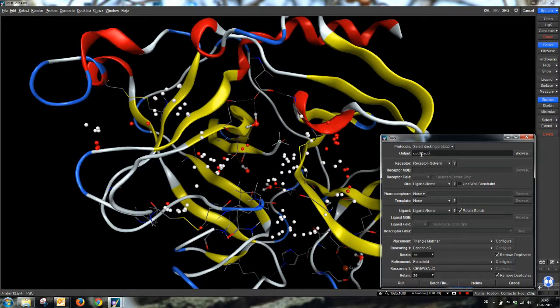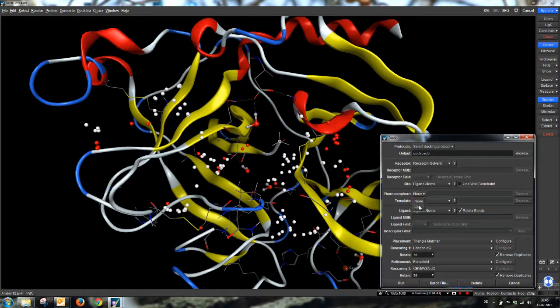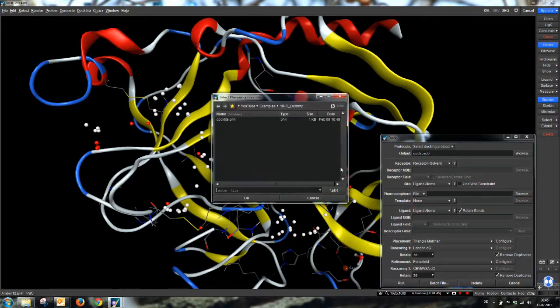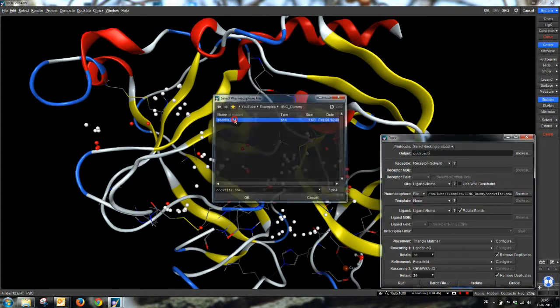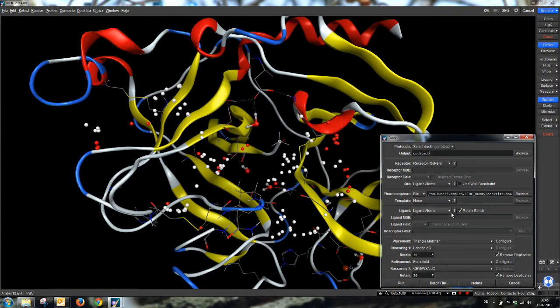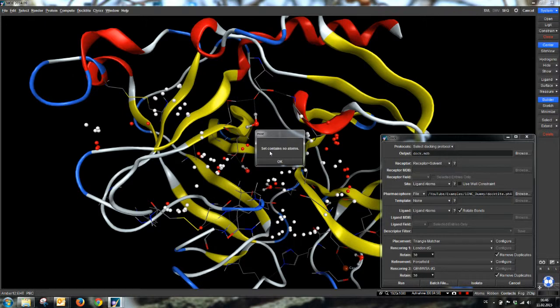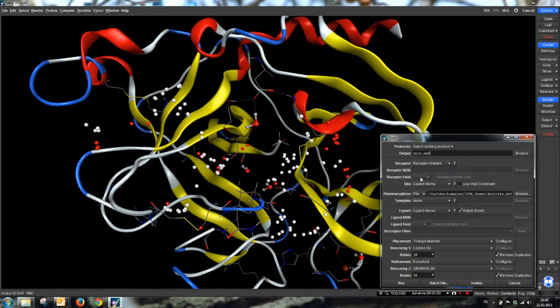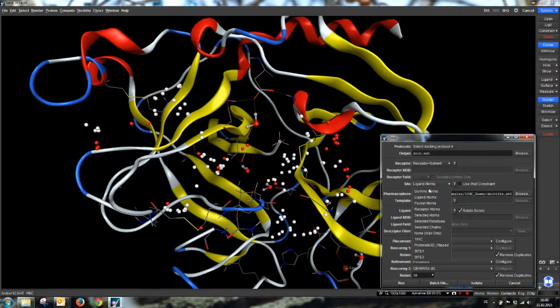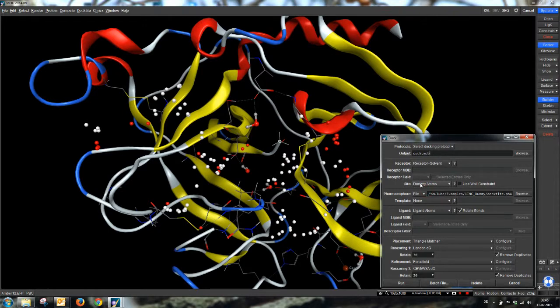Okay, we use the default output name. We use our pharmacophore file, just the automatic one, like in the last example. But now, you see, before we used as the site definition ligand atoms. We can't use this one because the set contains no atoms. But we created dummy atoms. We can now use site dummy atoms.